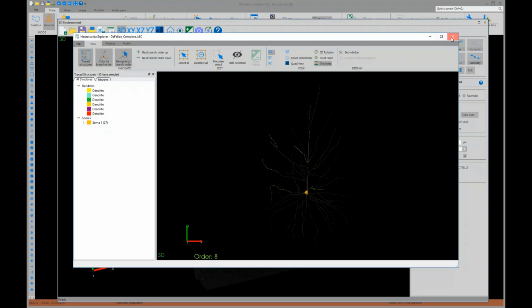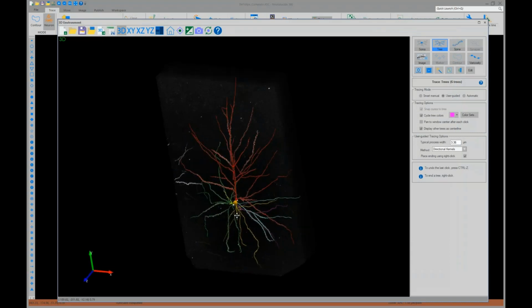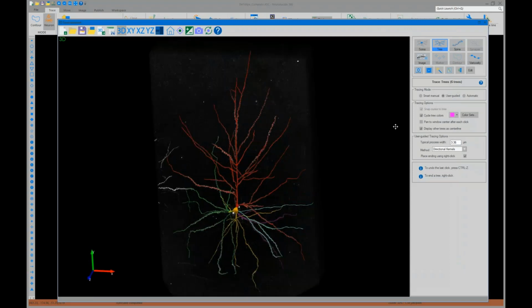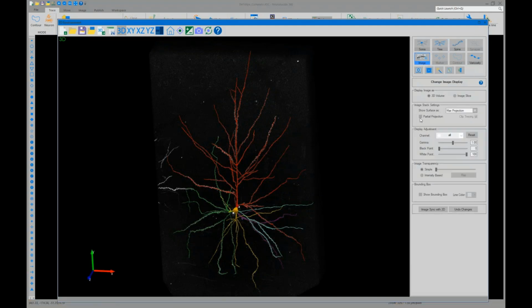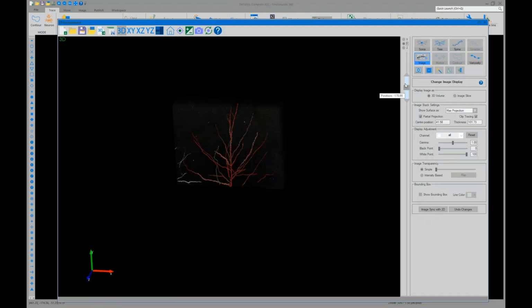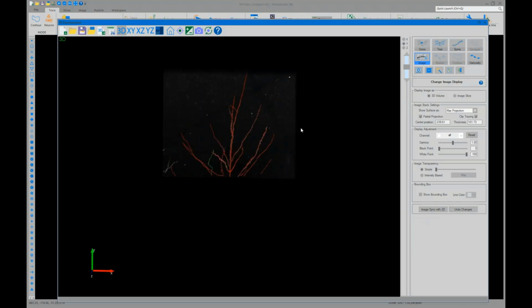So another tool that we had mentioned previously was the partial projection tool, which has become immensely helpful when reconstructing in dense networks. It's honestly one of my favorite tools that we have, and I found it to be so useful. It's under this image button, right here, partial projection. When you turn that on, you can see that a lot of the image may go away, but that's part of the tool.